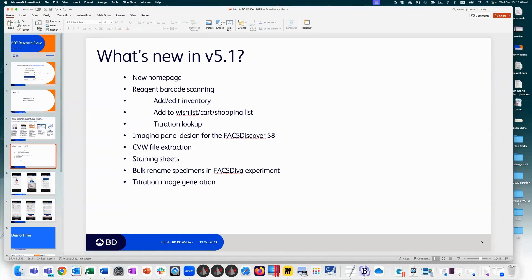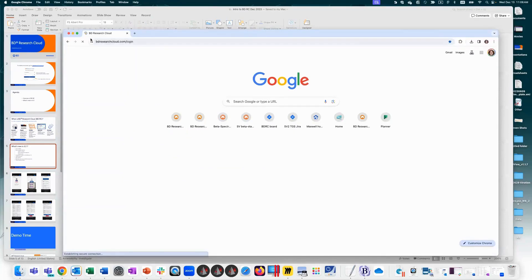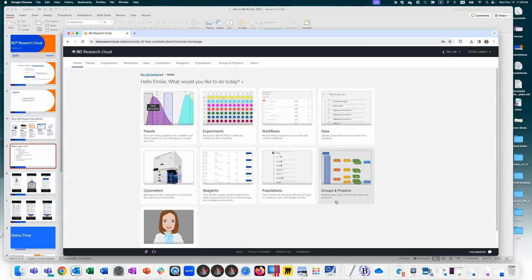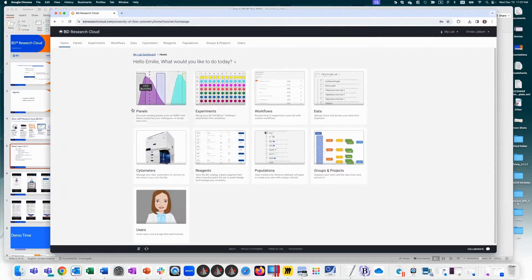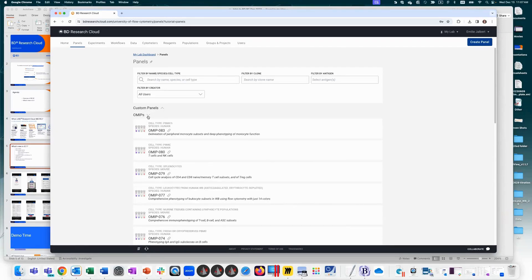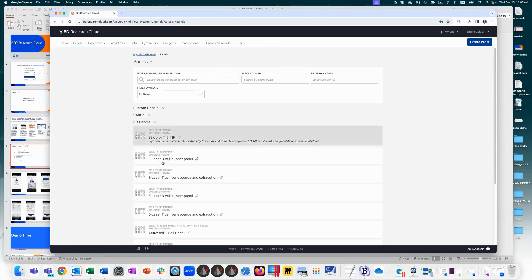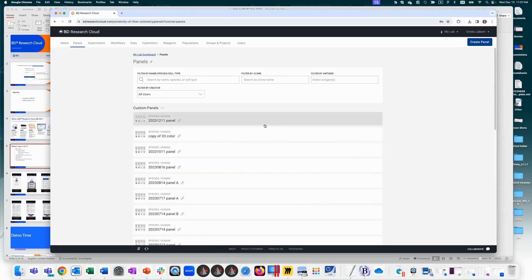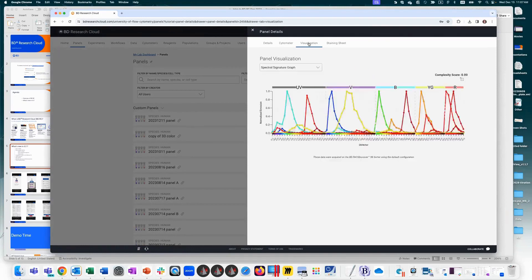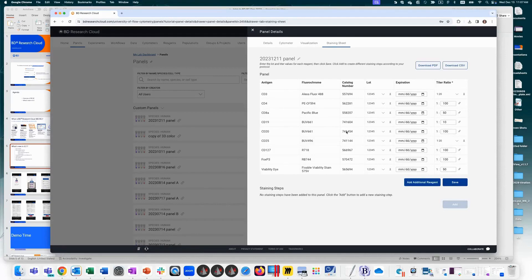Starting with the new homepage — navigate to bdresearchcloud.com and log in with your FlowJo portal ID. You'll see navigation tabs up top that also match tiles on the homepage. In the panels section, you can access custom panels you've generated, panels from lab mates, preloaded OMIPs available to all, and BD panels. These are useful for looking up panel information, visualizing spectral information, and accessing staining sheets.